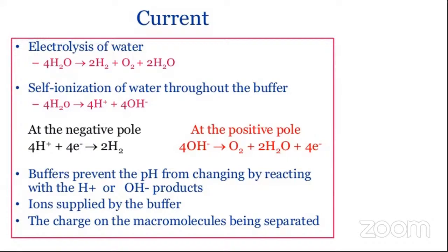So the charges on those molecules are never going to reach the electrode, because as they reach the electrode, they will undergo electrolysis, and electrolysis will completely destroy the molecule, correct? So our purpose during electrophoresis is that we just want the molecule to carry the charge and move under the effect of electric field without reaching the electrode. We'll stop the migration before the molecule reaches the electrode.